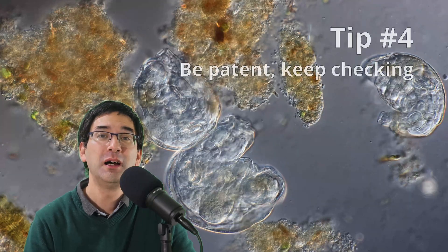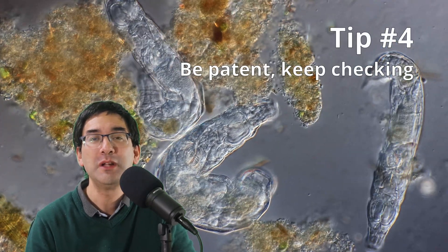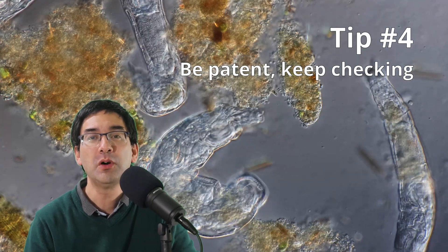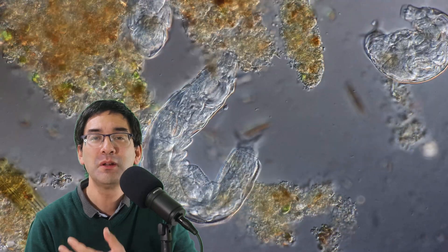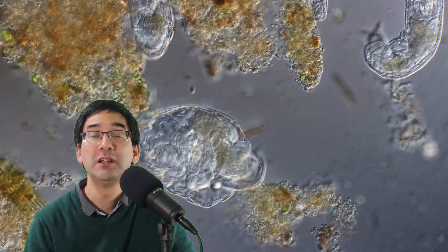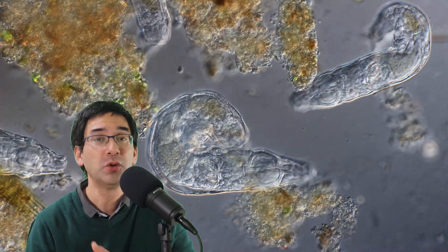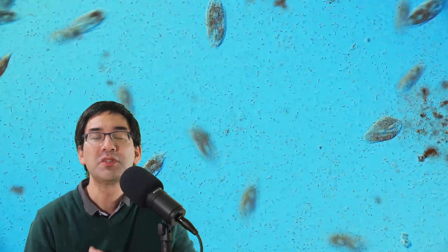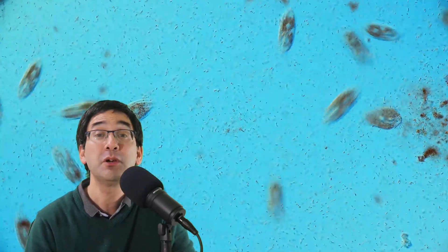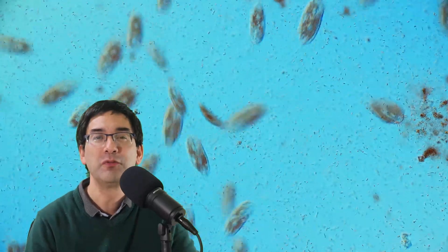Tip number four: keep checking. If you don't see any interesting water life today, wait until tomorrow, because there will be a progression of microorganisms. Certain microorganisms will grow, overgrow others, and then disappear, and over the course of a week or two you'll see different microorganisms increase in number — and paramecia are generally one of the dominant forms you'll find.